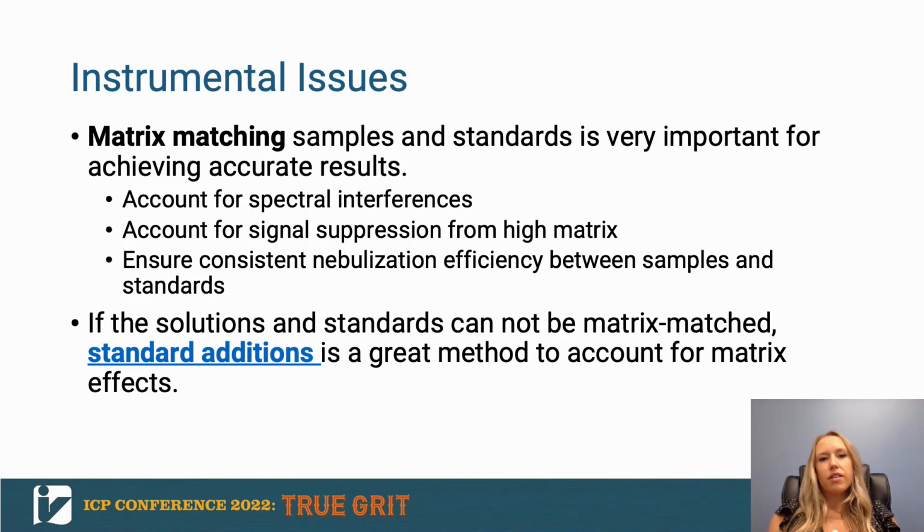Another thing that you may not think of as often is the actual physical properties of your solution. So these are all going to affect how your aerosol is formed, the surface tension, the viscosity. You want to make sure that those are matched in your standards to your samples to make sure that your nebulization efficiency is consistent. If you aren't able to completely matrix match your standards and samples, a really good option that we recommend is standard additions.